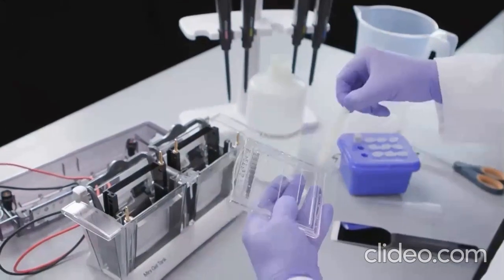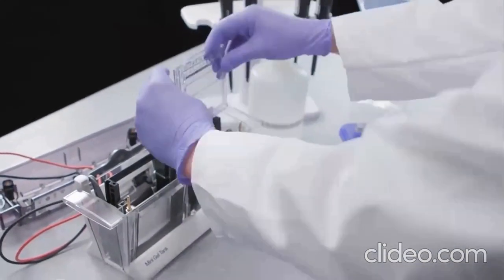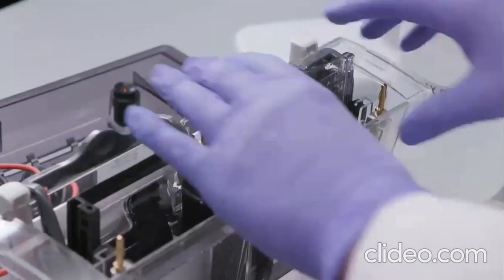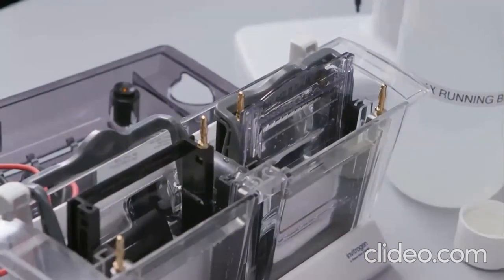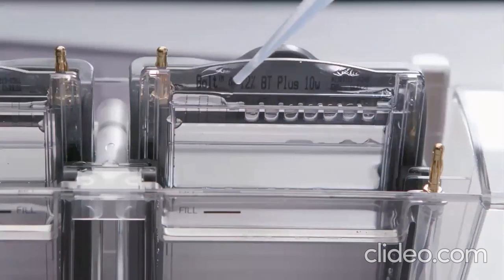In order to make the gel easier to load, place the gel cassettes in front of the cassette clamps in the tank with the wells facing toward you. Hold the gel so that it doesn't drop down all the way in the tank while pulling the cam handle forward. This will hold the gel firmly in place while you load samples and standards. If you're running 2 gels, repeat this for the other gel. Fill the wells of the gel with running buffer.